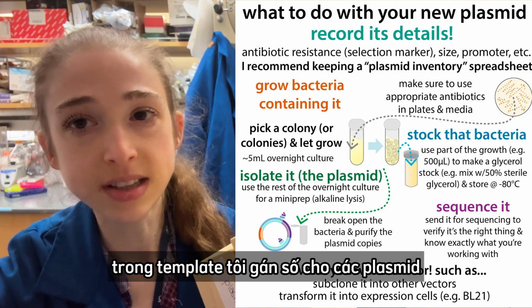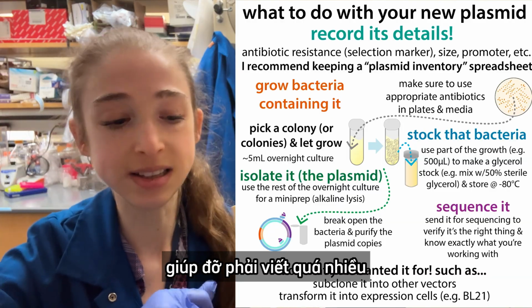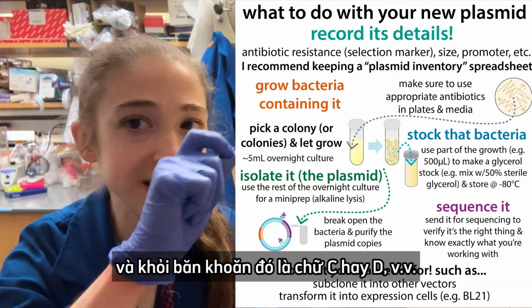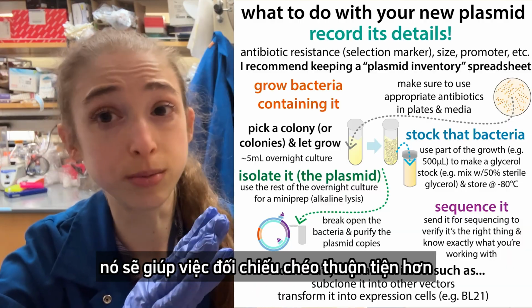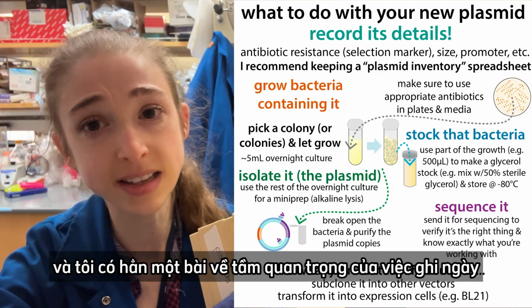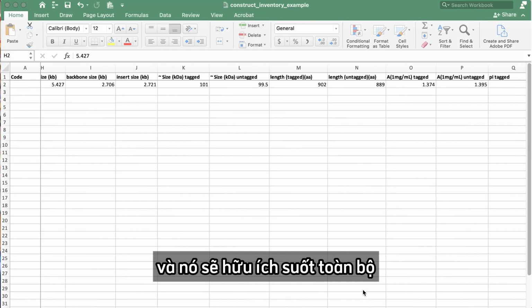You'll also see, if you look at the template, that I give my plasmids a number. This makes it easier to not have to write as much on a tiny little tube and then be wondering, is that a C or a D, and that sort of thing. Also, make sure you put the date on all your tubes. That's going to make it helpful for cross-referencing as well, and I have a whole post on the importance of keeping a date.